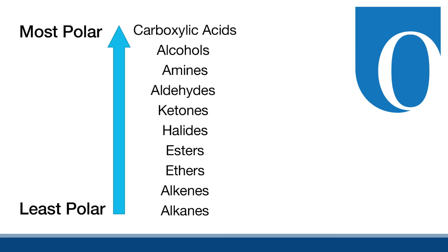The reason why the different compounds in a solution will migrate different distances is because of their different chemical structures, specifically their functional groups. As you know, different functional groups have different polarities. Some common functional groups and their relative polarities are shown here.